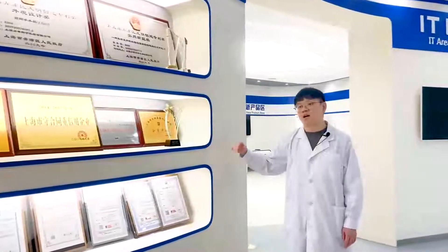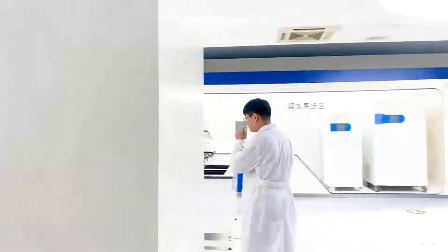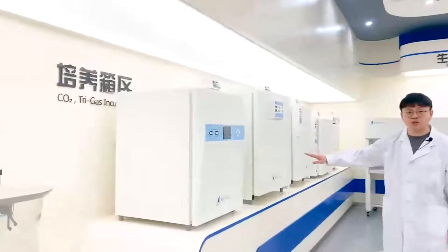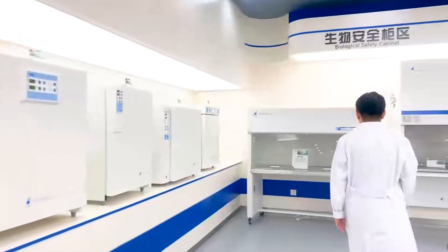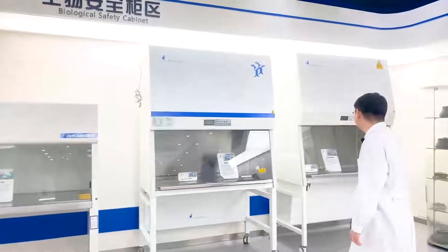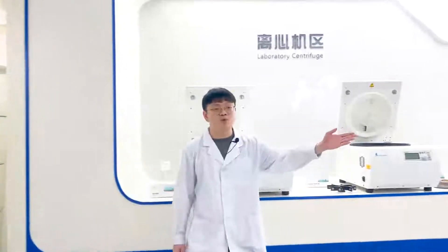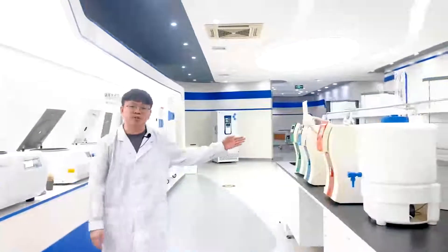Let's take a look at our laboratory solution area. Here we have the area for CO2 incubators, clean bench, biosafety cabinet, CY series, centrifuge, water purification system, PCR, and real-time PCR.